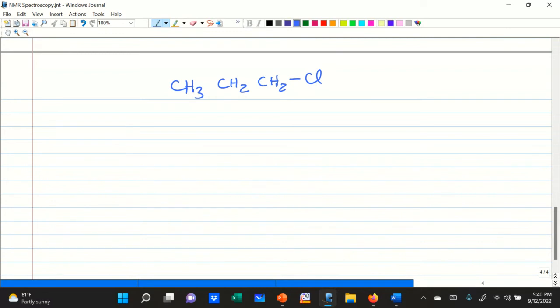What do we mean by shielding? We mean the nucleus. Let me write it on the right hand side. A nucleus as such, here it is, and we are talking about the nucleus feeling the external magnetic field strength B naught. So it is the nucleus that feels that magnetic field strength, right? And that creates a corresponding tiny bar magnet strength. It causes that corresponding induced vector or induced magnetic moment.